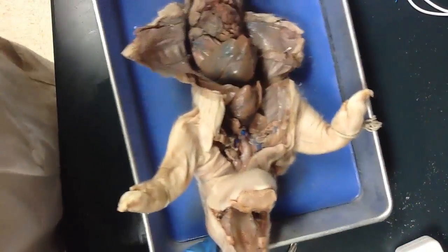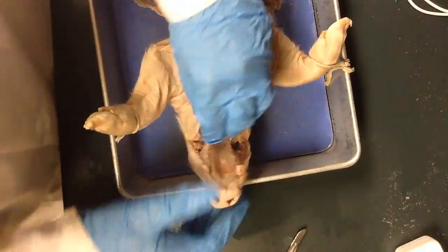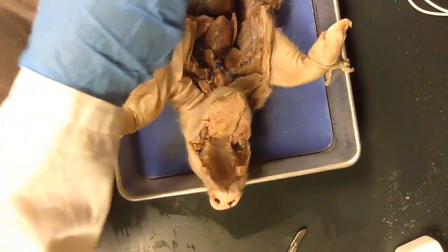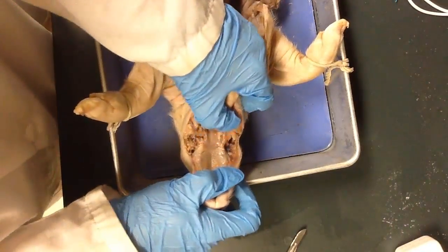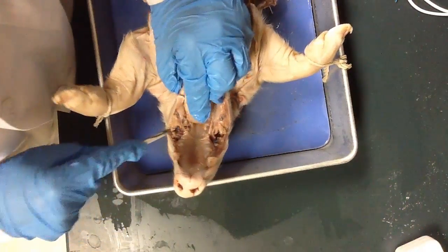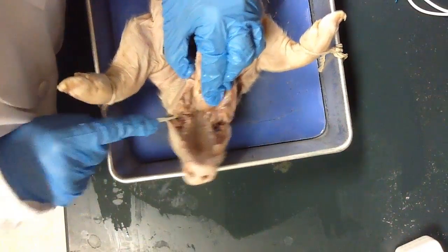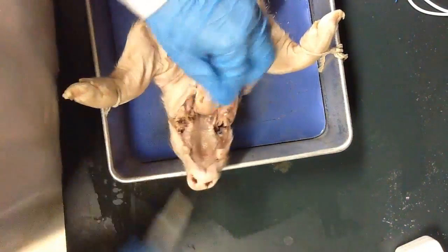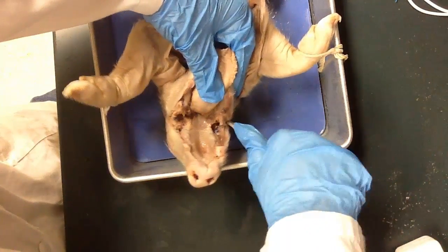When you're asking yourself, "is this far enough?" the answer is: when you can see the epiglottis, then you've cut far enough. You do have to kind of manhandle your pig a little bit to get to the point where you can see the epiglottis. There is some bone to cut through, and some tendons and muscles and other good stuff.